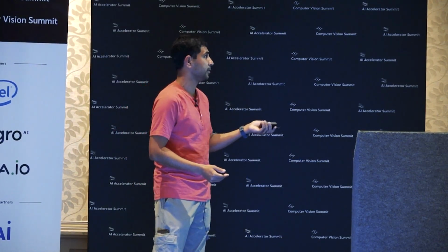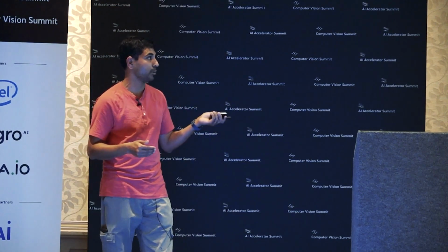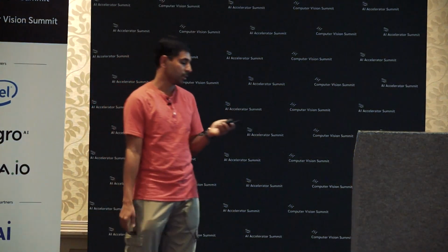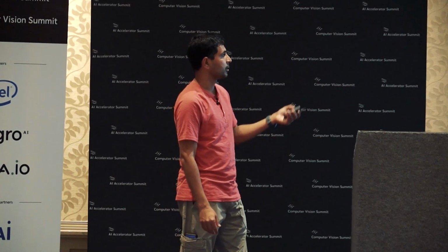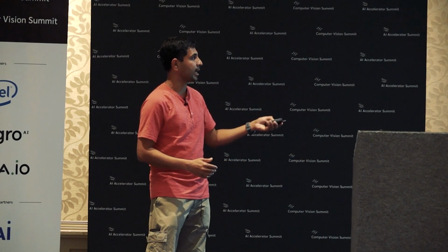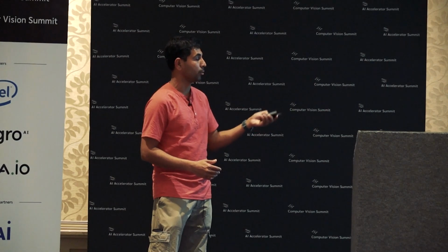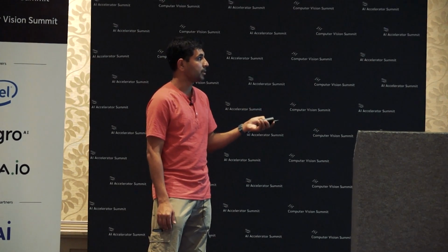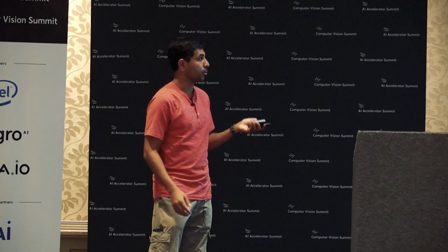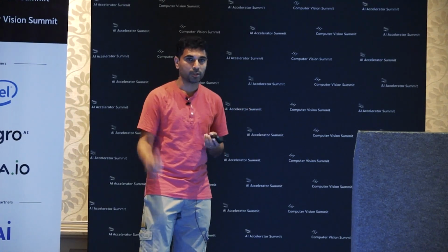So that's again a computer vision model playing a key role in automating the experiments. It reduces time, number one. It also reduces photo damage. So the ideal pipeline would be you have this bright field stack of images, and you are literally able to predict, using a U-Net or whatever model you pick, all of these different stained channels, and then you can false color them and merge them together, so you can see all of them together in one image, all coming from a vision model.